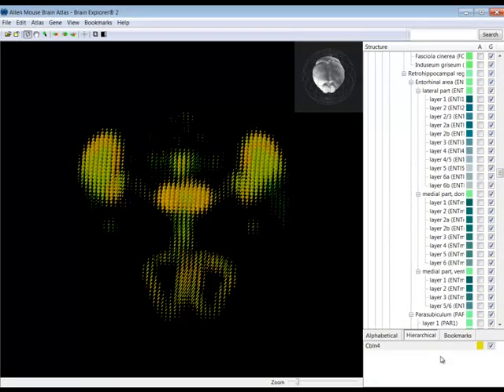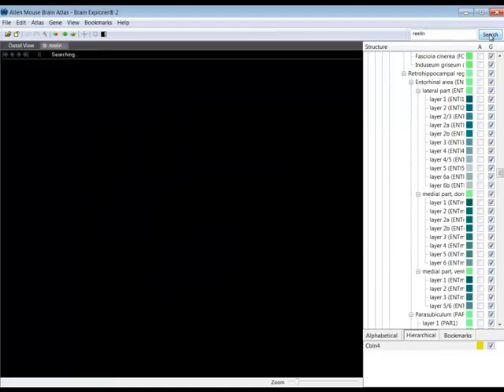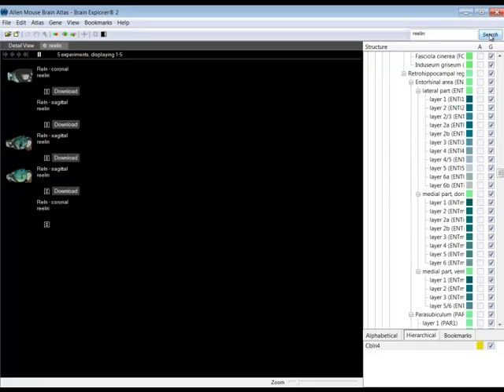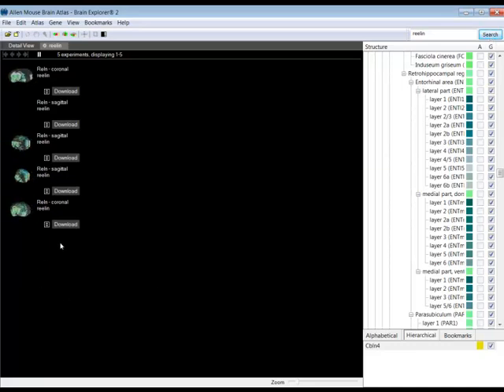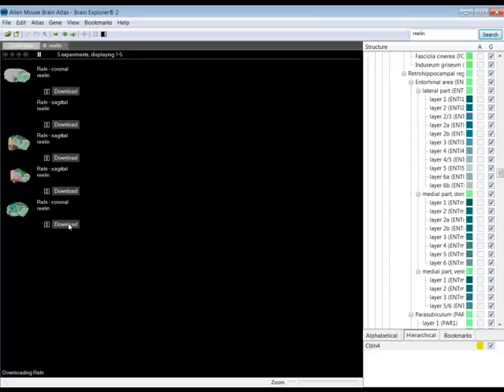You can view the gene expression patterns of more than one gene by selecting another gene from the Allen Mouse Brain Atlas, or you can search for a gene from the search box above the structure ontology. I've searched for a gene named Relin. Another tab will open up in the main viewer, allowing you to choose from the experiments that fit your search criteria.